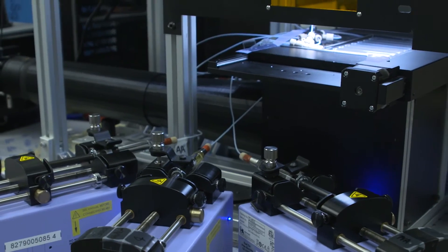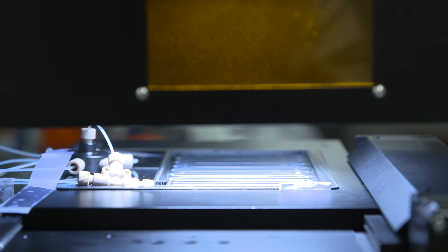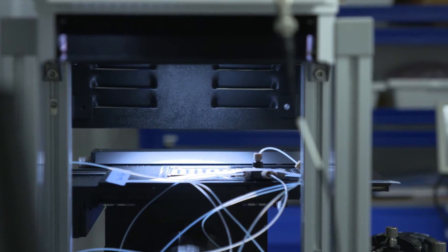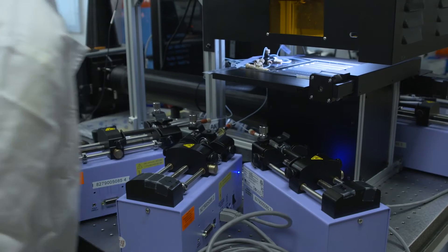When we think of a chemistry lab what we typically imagine is a lot of flasks and glassware and burners. The chemistry lab of the future doesn't look anything like that. What it looks like is machinery that you will see light sources, pumps, computers and a small place where you do hundreds of experiments all at one go continuously.